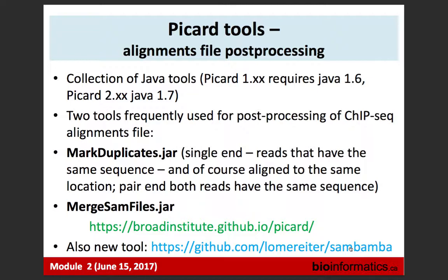In ChIP-seq, do we have any quality trimming step at the beginning? Yes. If there are some duplicates, but for example there is one read that has a base pair that is trimmed, do you consider it a duplicate? Yes. Generally speaking, if there are alignment coordinates, say chromosome 1 base 1000 and another with chromosome 1 base 1000, it will be considered a duplicate.